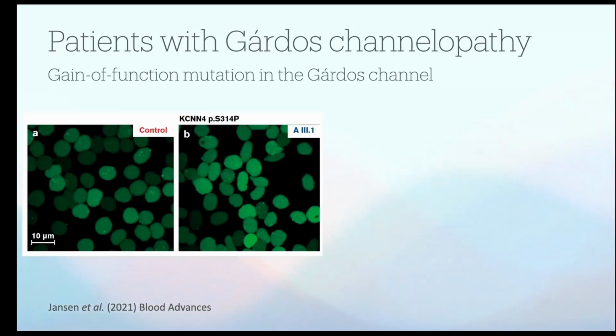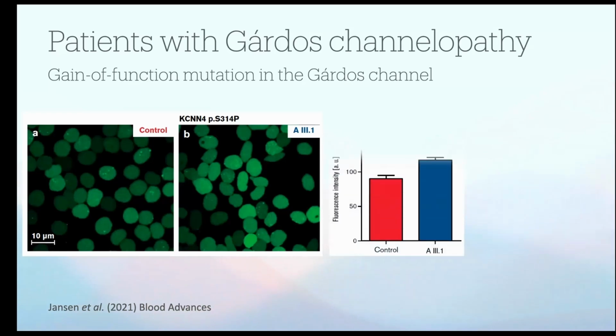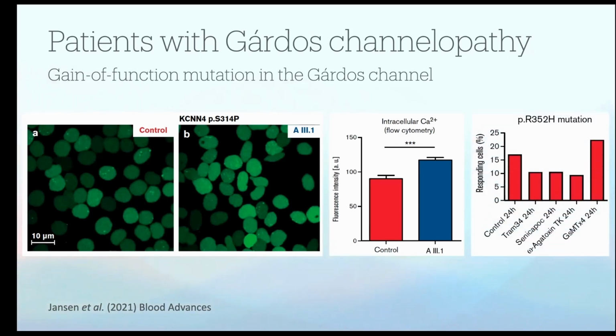microscopic images, but also in flow cytometry. And if you now look at the patient cells, if we incubate the cells for 24 hours with particular channel modulators, this is the result.